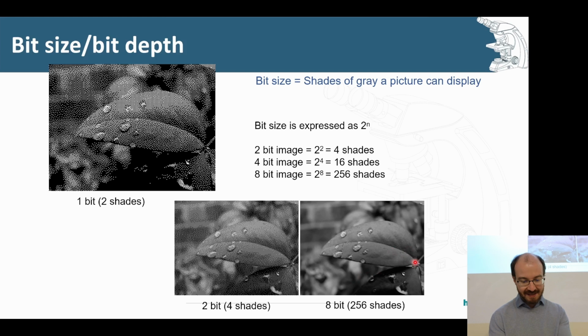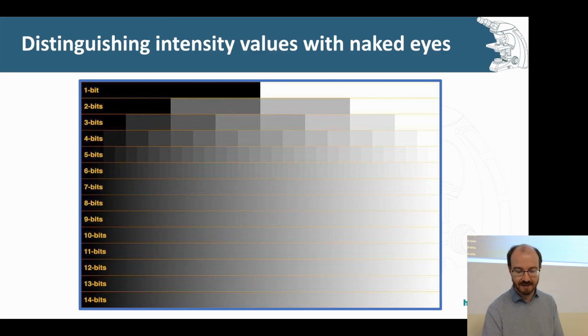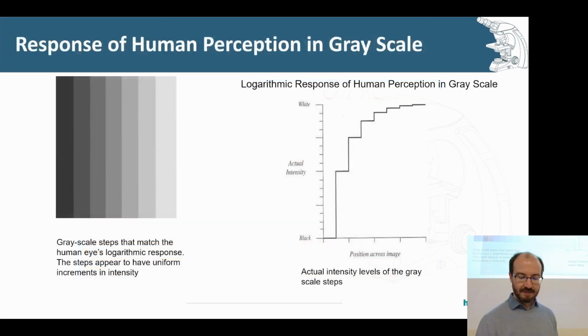But again, the image is not really there. The image is a representation of this matrix of values, and to our eye it might look smooth. To the computer it might not be sufficient. There might not be enough intensity levels, so that to the computer it might look like this. It's like, oh, this is so coarse. Now I can't actually do the proper separation between what is the leaf and what is the background, whereas if it had more intensity levels, it might be able to. So don't purely rely on your eyes. Remember that there is a matrix of values behind this scene. It's just another representation of the same thing of increasing gray levels. It becomes increasingly smooth, the transition from black to white.